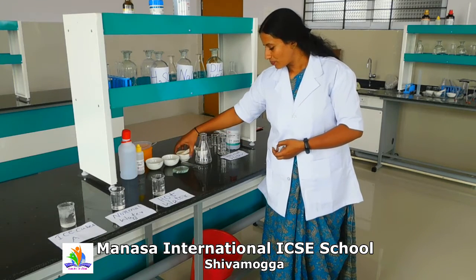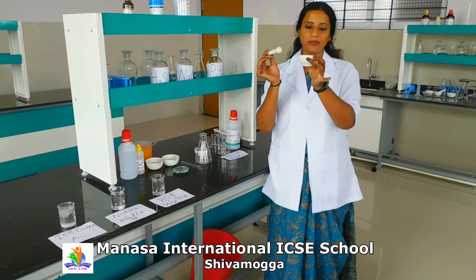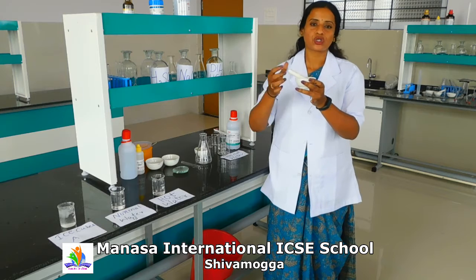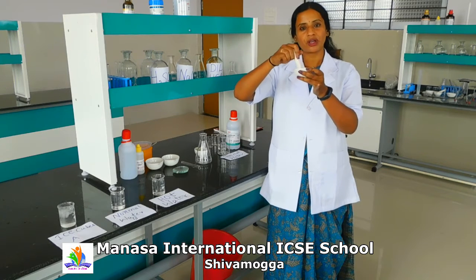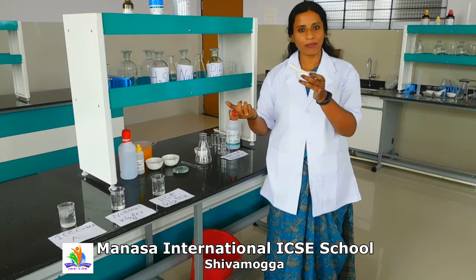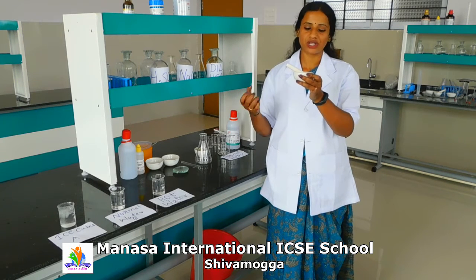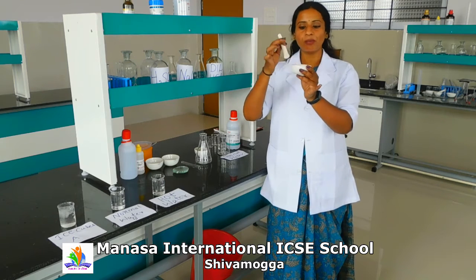The next is the mortar and pestle. This is the mortar and this is the pestle. Most of the solid, crystalline chemicals have to be crushed so that they can get mixed with the solvent we use in the chemical reaction. This is what we use in the chemistry laboratory, and this is known as mortar and pestle.